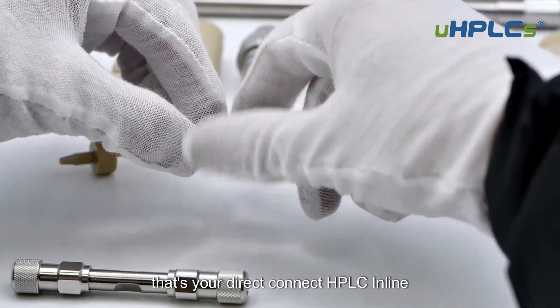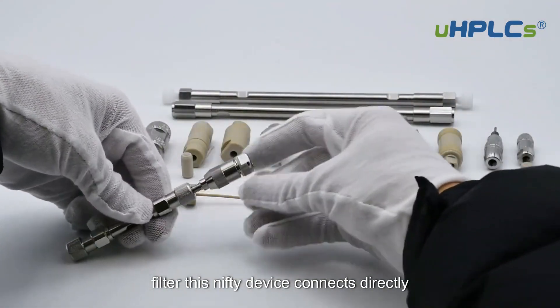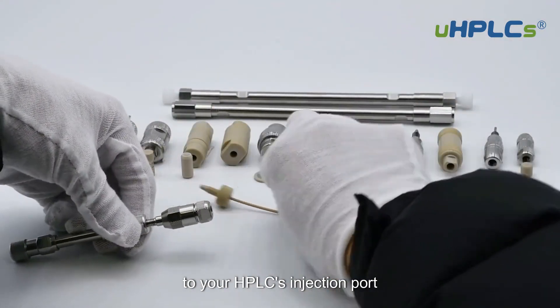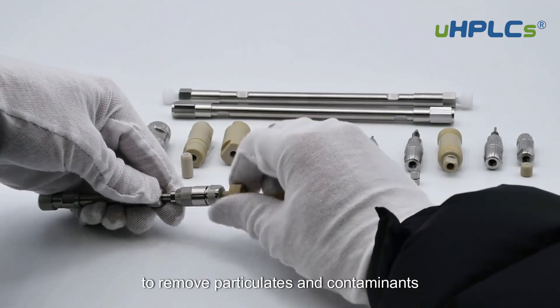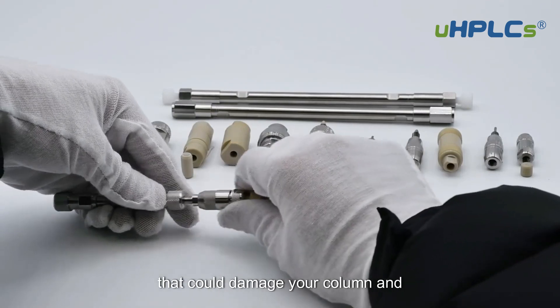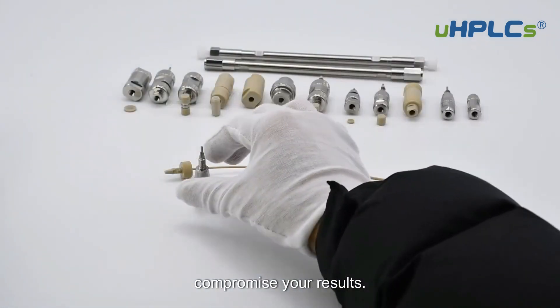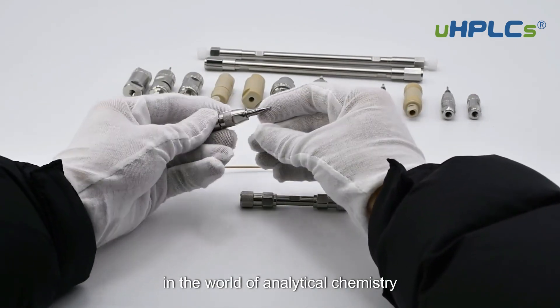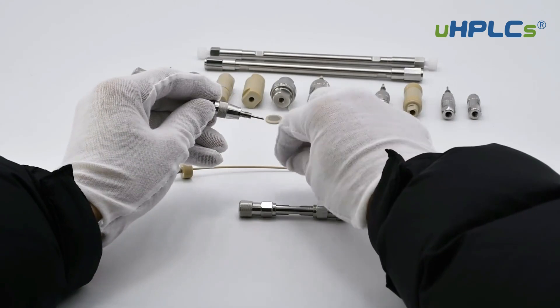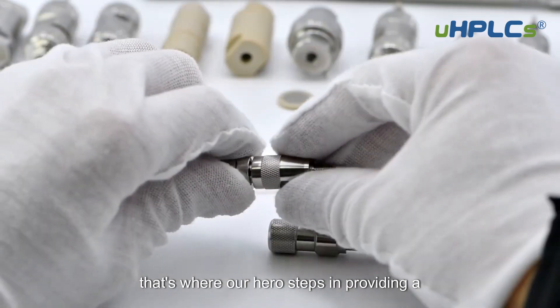That's your Direct Connect HPLC Inline Filter. This nifty device connects directly to your HPLC's injection port. Its primary mission: to remove particulates and contaminants that could damage your column and compromise your results. In the world of analytical chemistry, precision is king — even the smallest impurity can skew results. That's where our hero steps in.